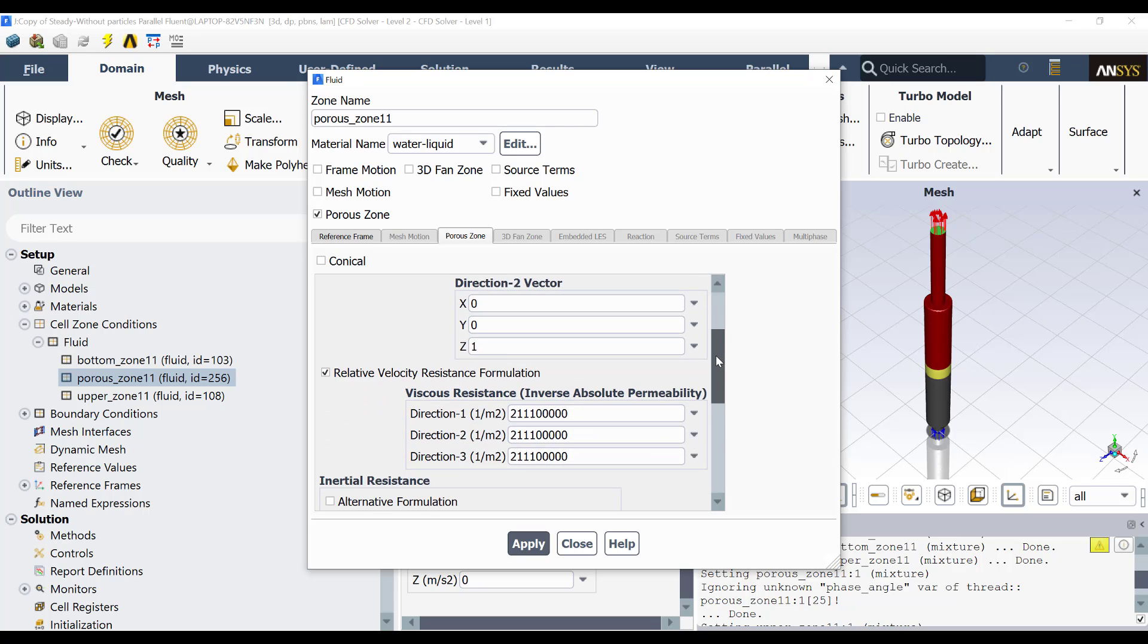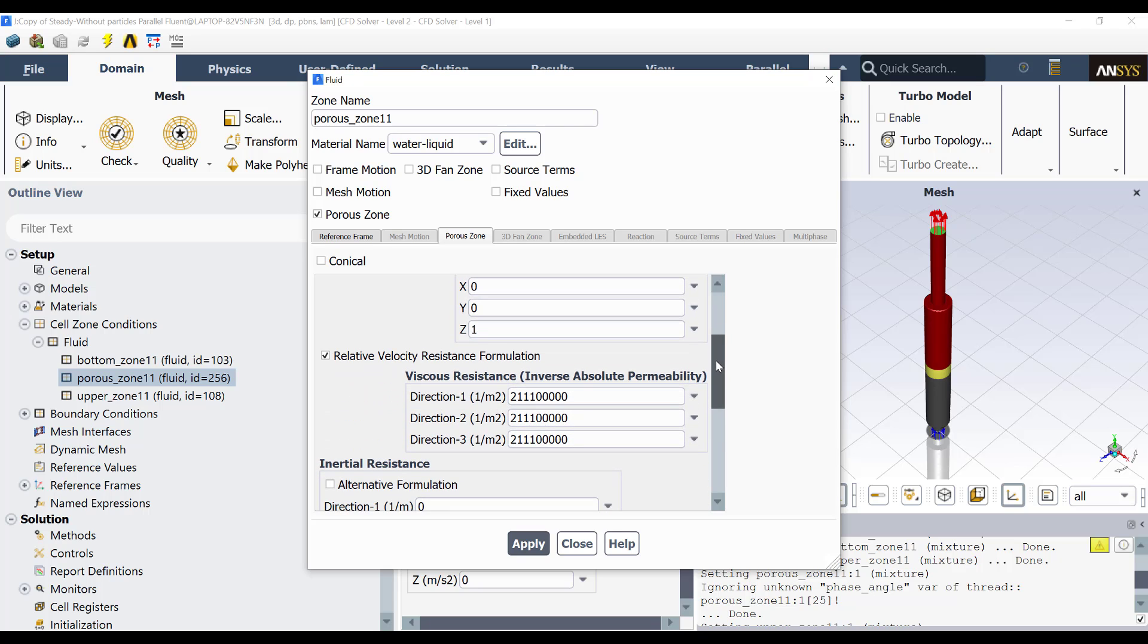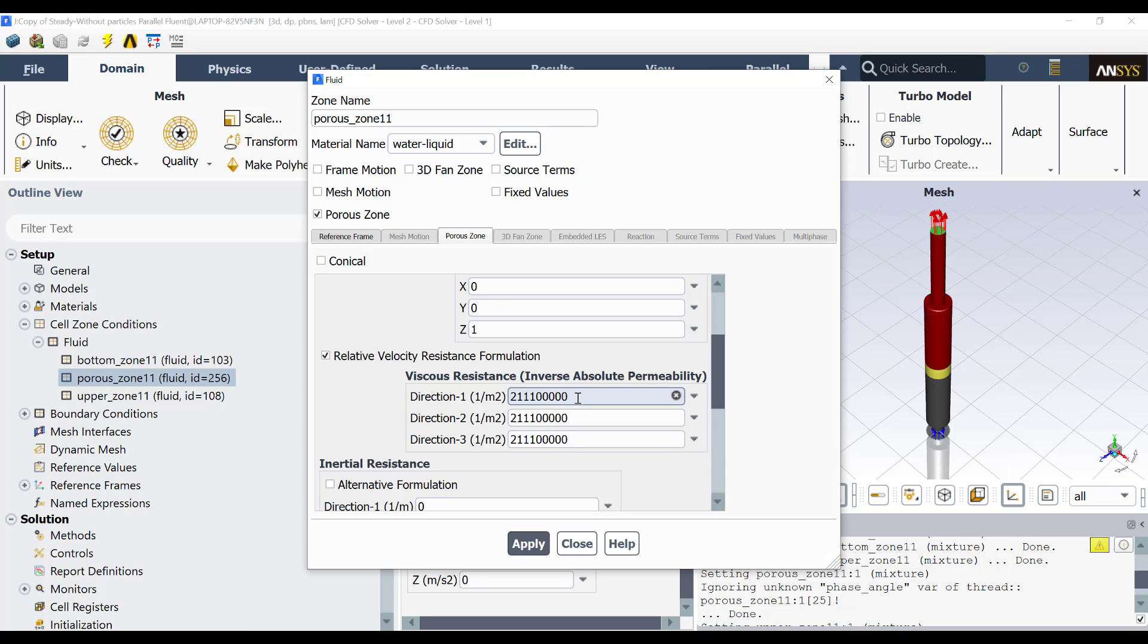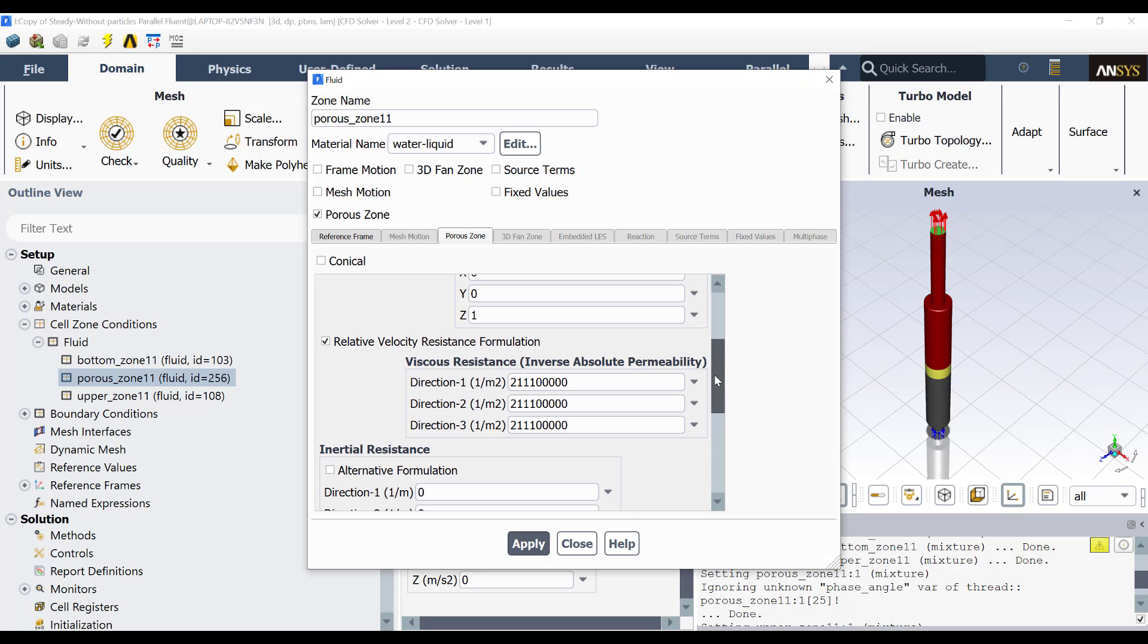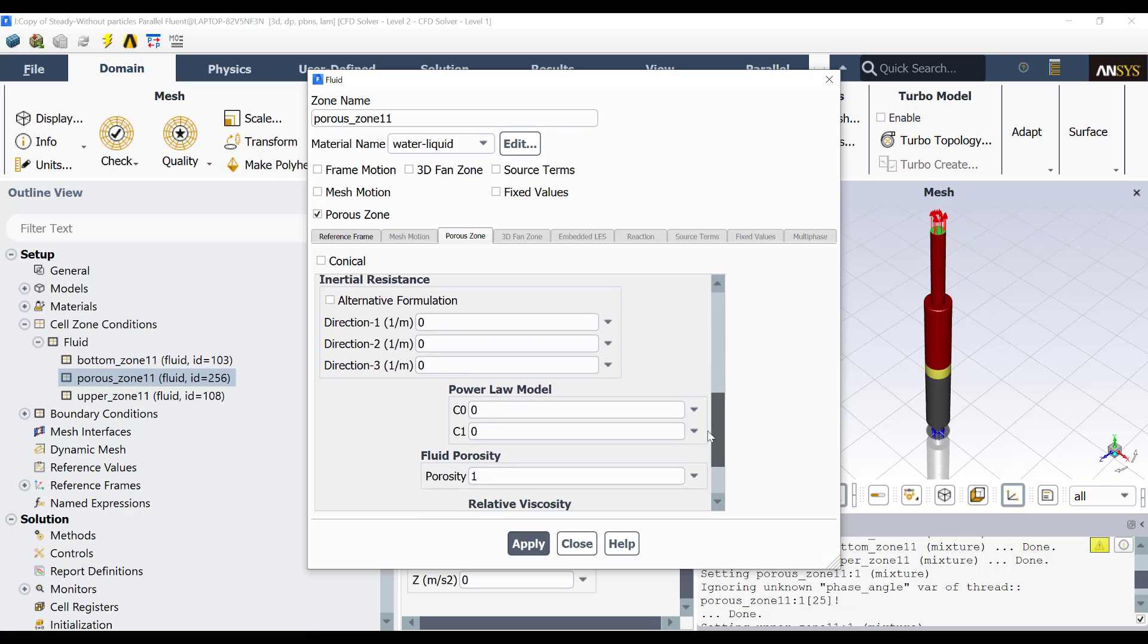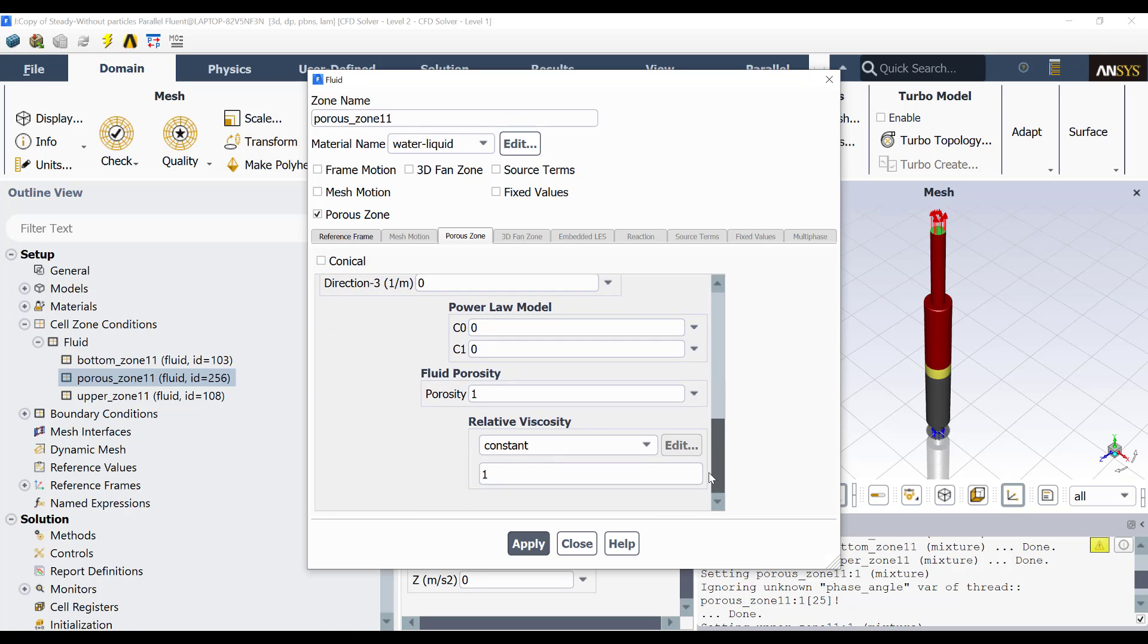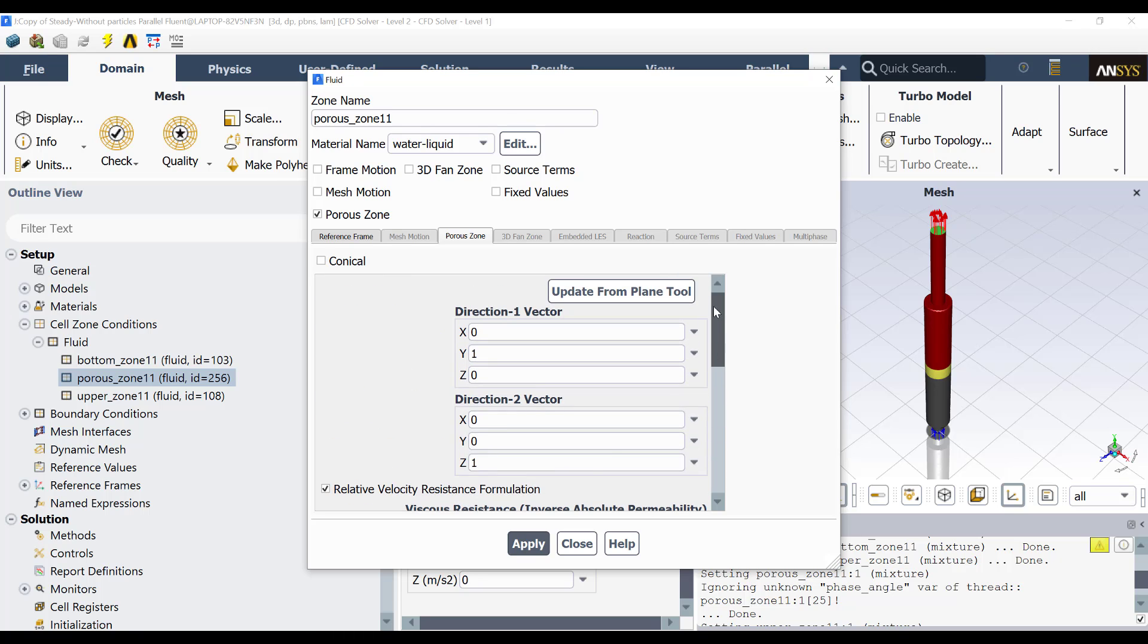And here we have the viscous resistance. This is a very, very high value. In fact, these are the default values. You can change this, but you need to calculate and estimate which will be the real values for this. Then you have to calculate it. And that's it. Everything is by default right now.